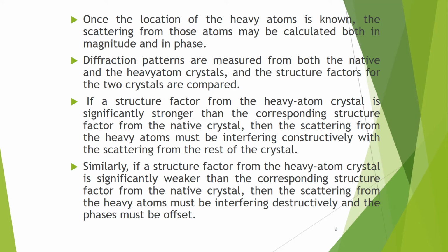If the structure factor from the heavy atom crystal is significantly stronger than the corresponding structure factor for the native crystal, then the scattering from the heavy atom must be interfering constructively with the scattering from the rest of the crystal.